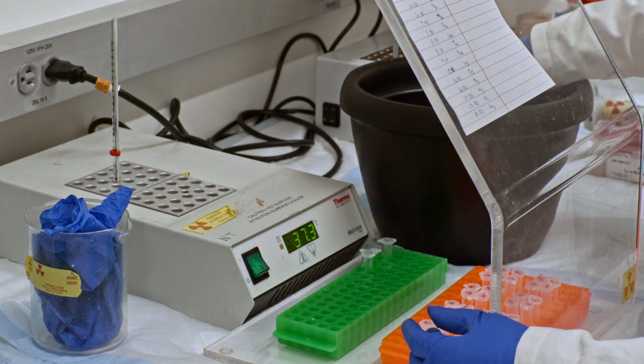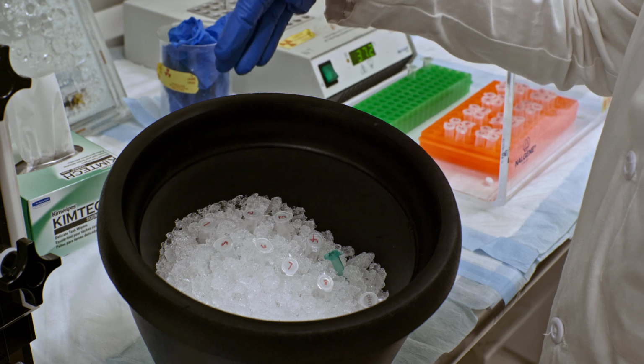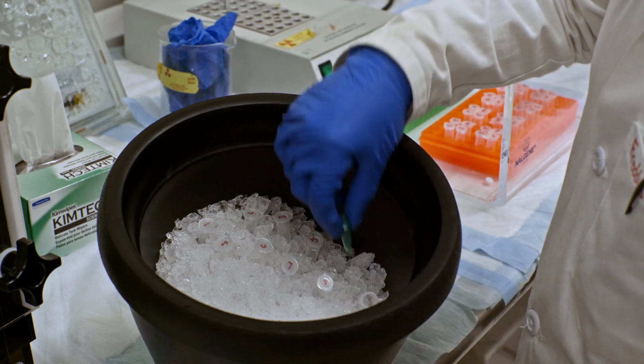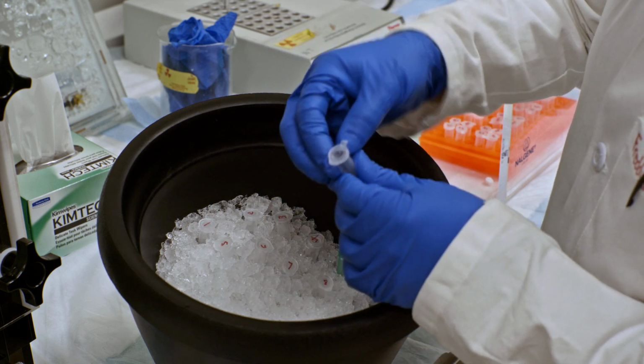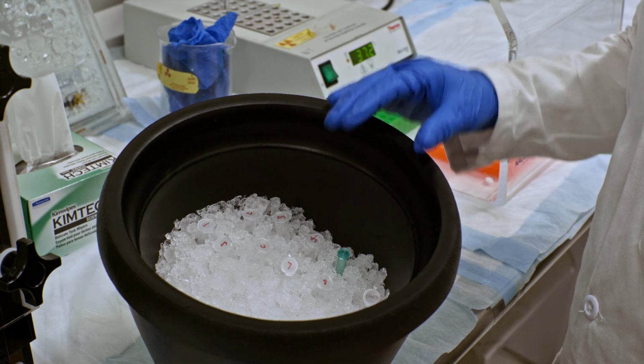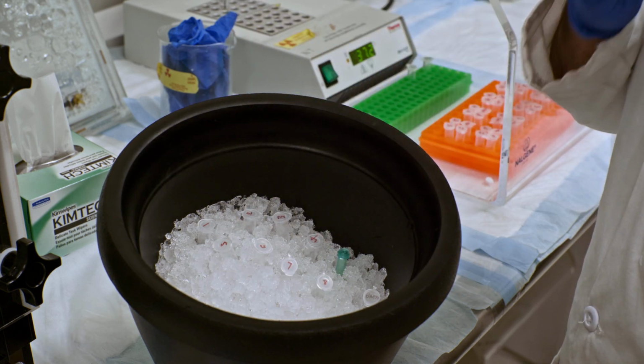These different samples, again, have currently reaction buffer where the enzyme will work best. Here we have an aliquot of the enzyme, and then here we have dNTPs. So, what we're going to do is that we're going to put aliquots of the enzyme into each of these reaction vessels.